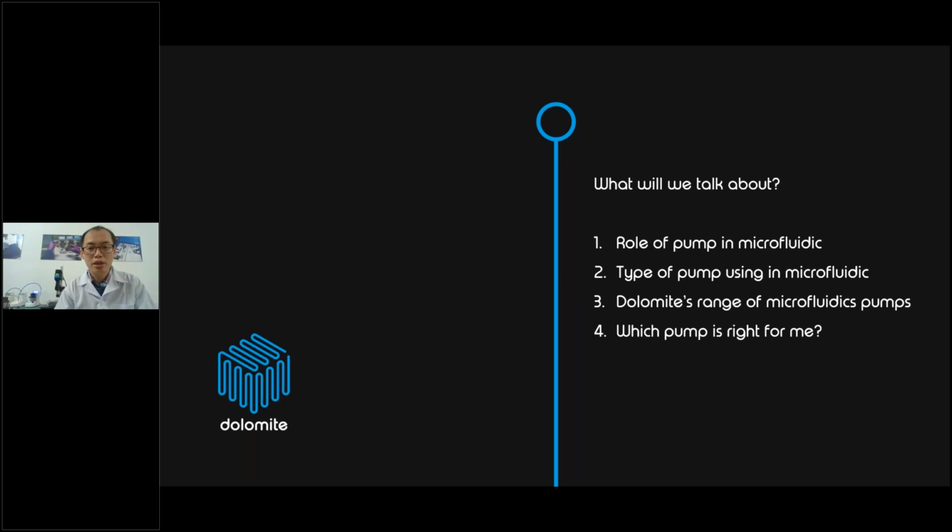The topic today contains the role of pumps in microfluidics, the types of pumps used in microfluidics, the Dolomite range of microfluidic pumps, and finally, which pump is right for you. Let's talk about the role of the pump in microfluidics.